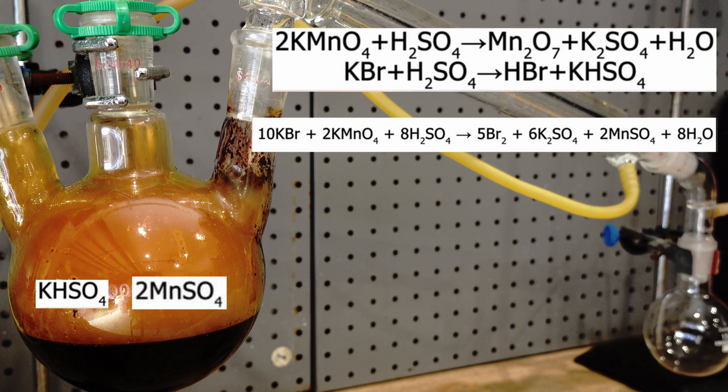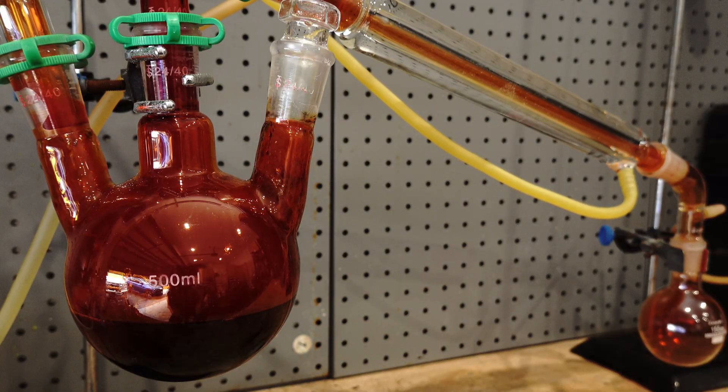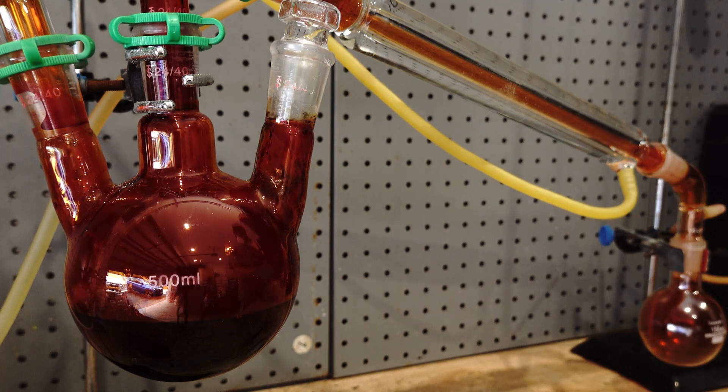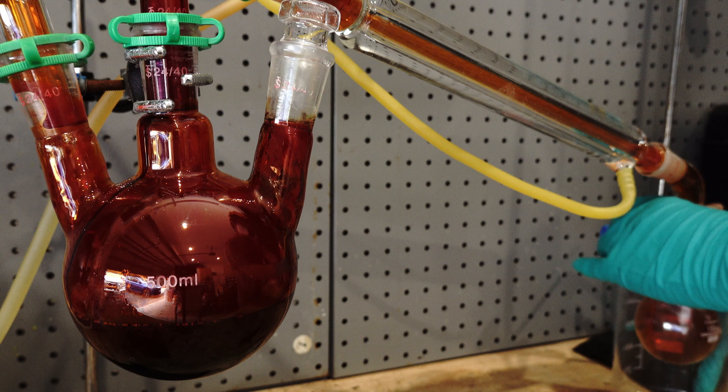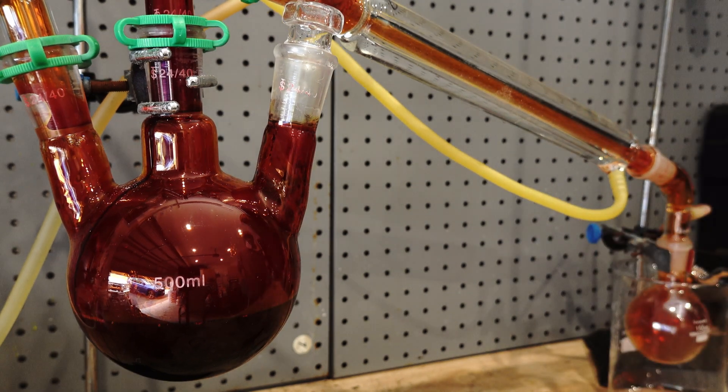As the reaction continues, the colour of the apparatus changes as the density of the Bromine vapour increases. I added an ice bath to the collection flask to hopefully further condense any escaping Bromine vapour.